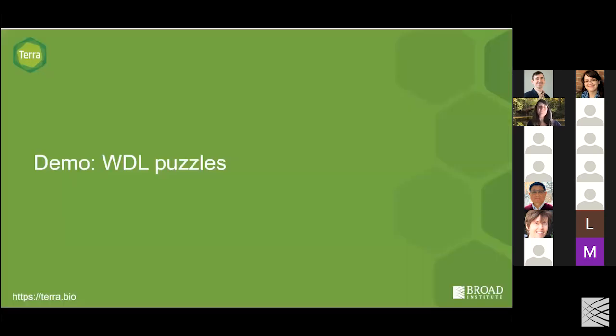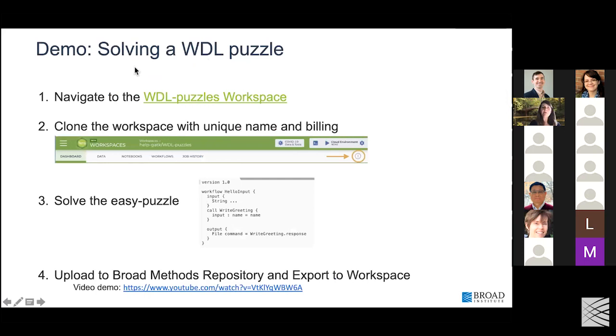So let's get a little bit of practice working with WDL scripts and getting a sense of how you could actually go in, download a WDL script, modify it, and re-import it back to your workspace. Because for a lot of people, they might want to do their own WDL scripting and get a little bit more practice with this. So we're going to do a little demo first.